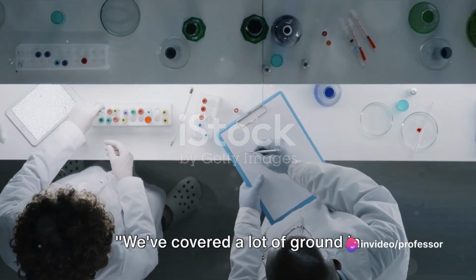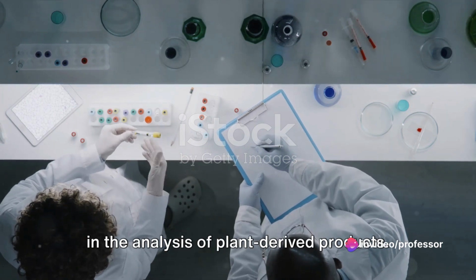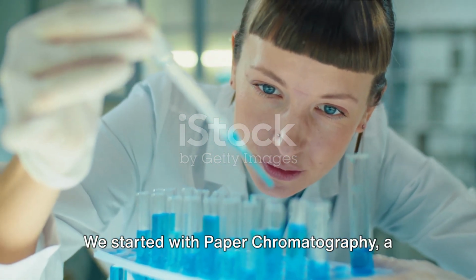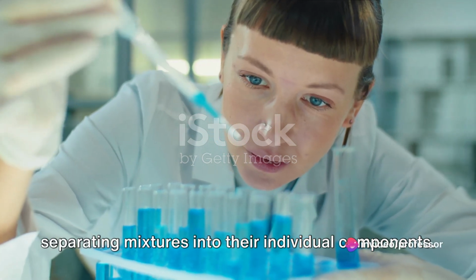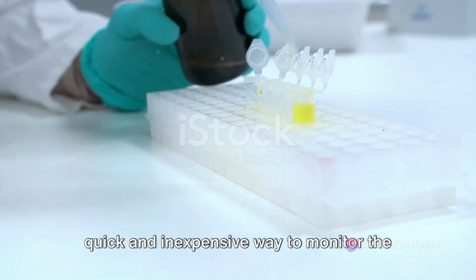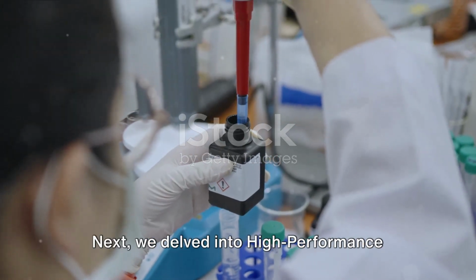We've covered a lot of ground in understanding the role of chromatography in the analysis of plant-derived products. Let's take a moment to recap. We started with paper chromatography, a simple yet powerful technique for separating mixtures into their individual components. We then moved on to thin layer chromatography, a method that gives us a quick and inexpensive way to monitor the progress of chemical reactions.